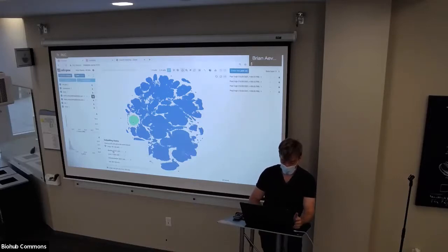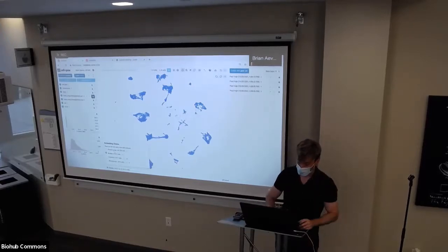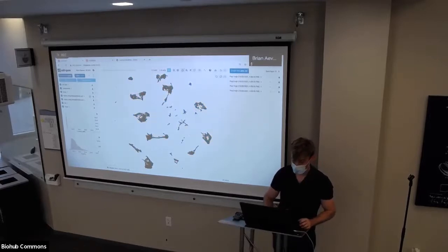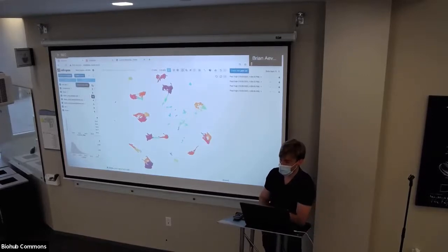Let's say I have a bladder, I've selected bladder cells and I've done re-embedding on bladder cells. So now, let's say I want to cluster these bladder cells. I click Leiden clustering, and then I get UMAP bladder resolution 1. I color by it, and I also have the original cell type annotations. These cell type annotations were generated by experts, or a combination of experts and de novo annotation methods like OnClass or other things. So we also have cell types. Here we can use a lasso tool.